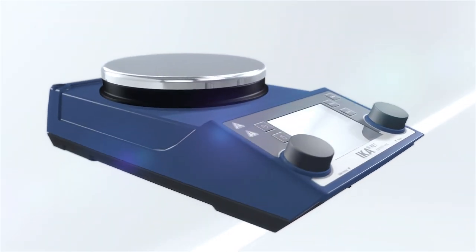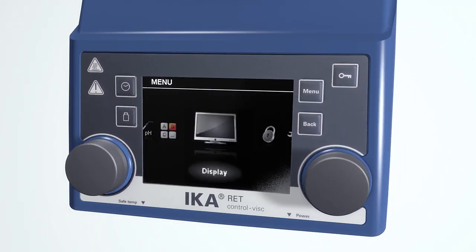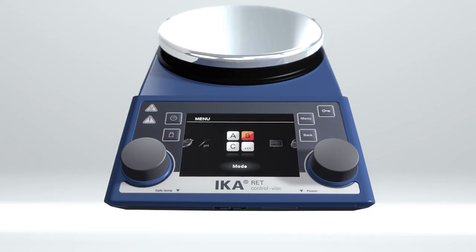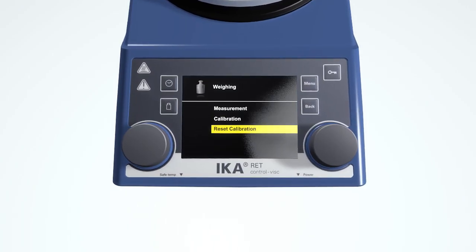Easy to use dial knobs allow simple navigation through the menu on the TFT display. Parameters for stirring, heating, weighing, and timer can all be adjusted.